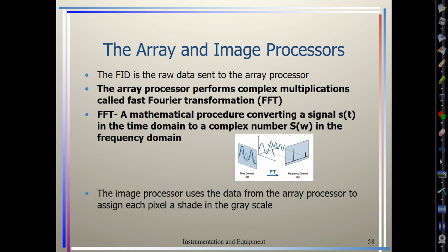But what you do need to know is that it is a mathematical procedure that is converting signal in the time domain to a complex number in the frequency domain.